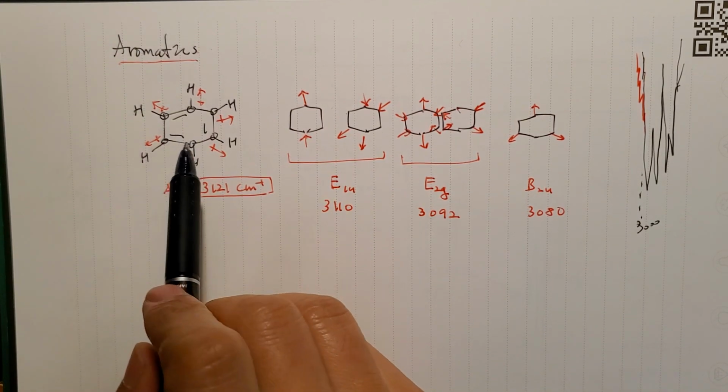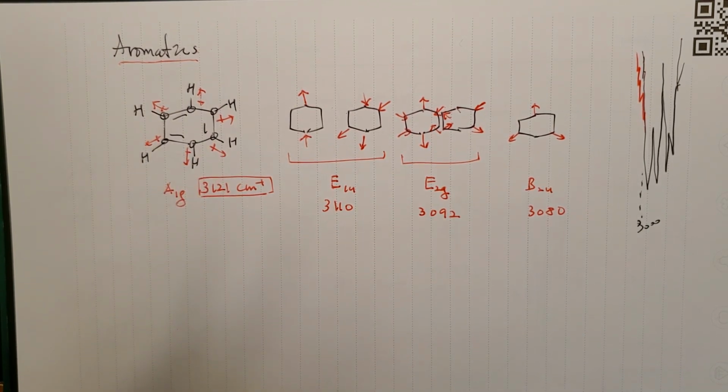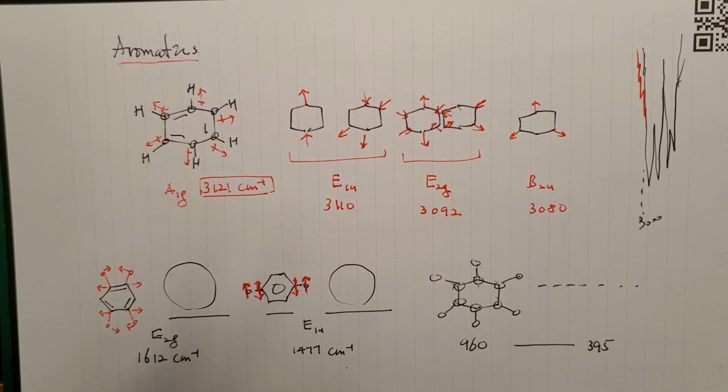Then there will be vibrations of the carbons of the double-bonded benzene ring. And I'm not going to go over these 20 different modes. I mean, literally more than 20 vibrations are possible. But I'm going to pick just a couple to address the point here.